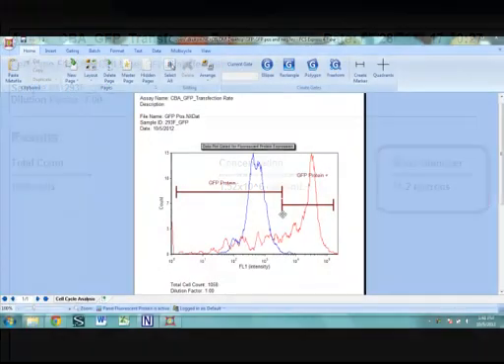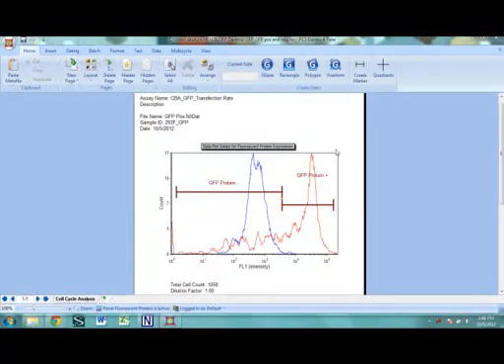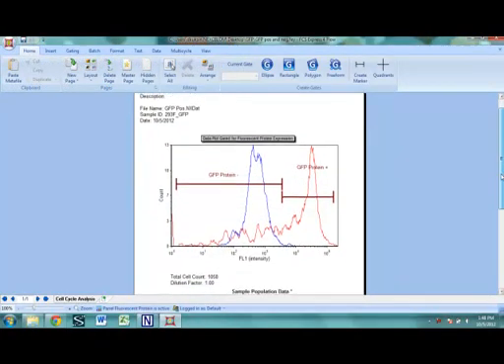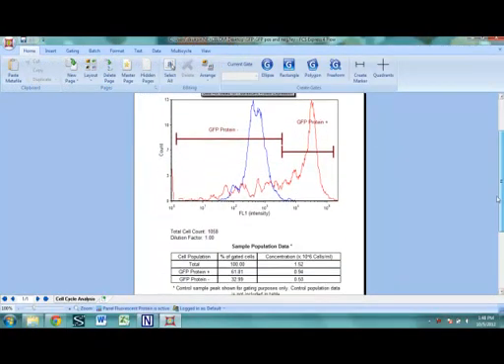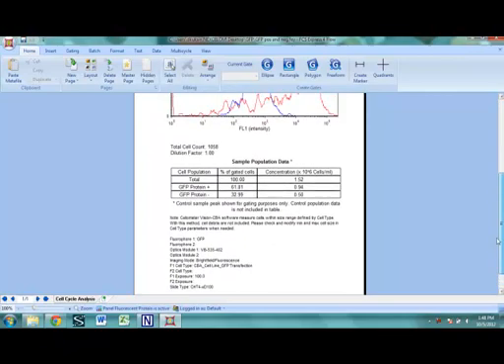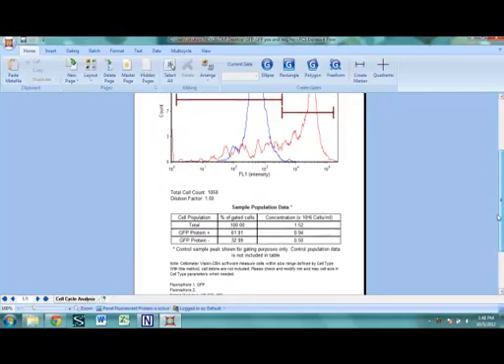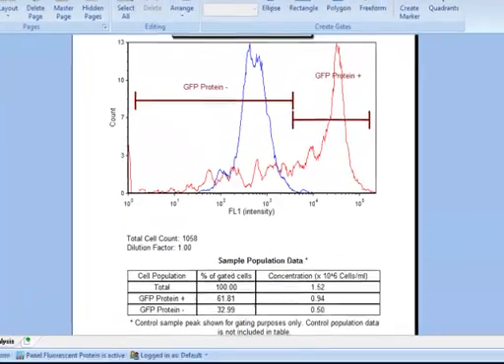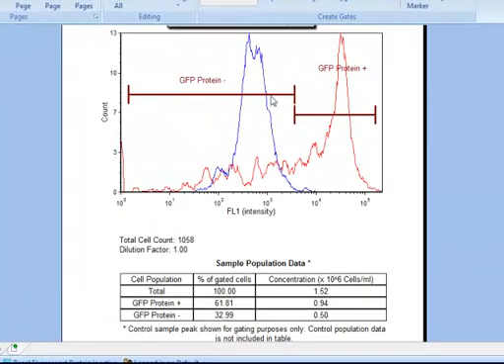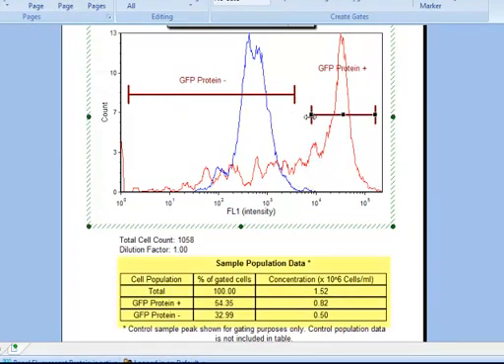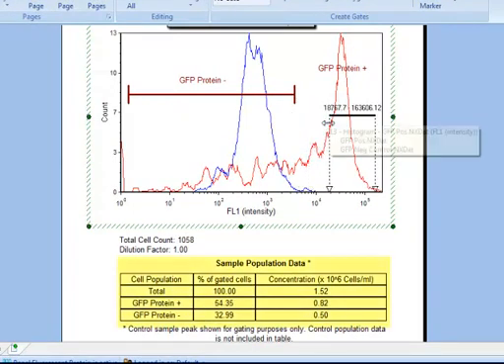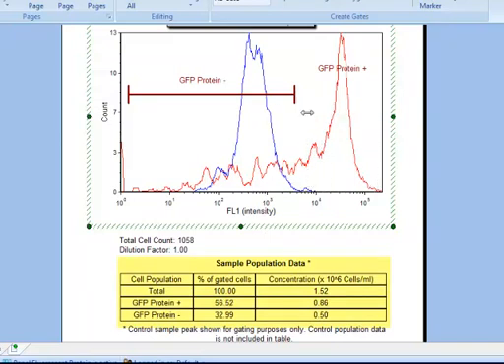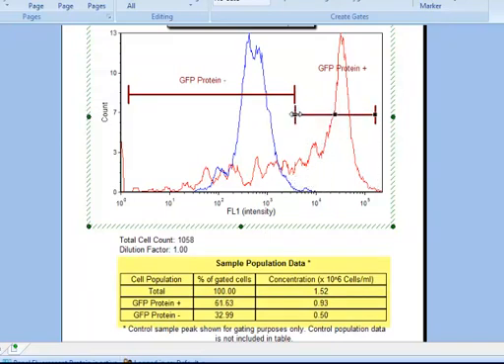Data is then exported to a pre-optimized FCS express data layout. The histogram for a control sample can be overlaid to assist with optimization of gates for treated samples. The number, concentration, and percent of GFP negative and GFP positive cells are displayed in the corresponding data table.